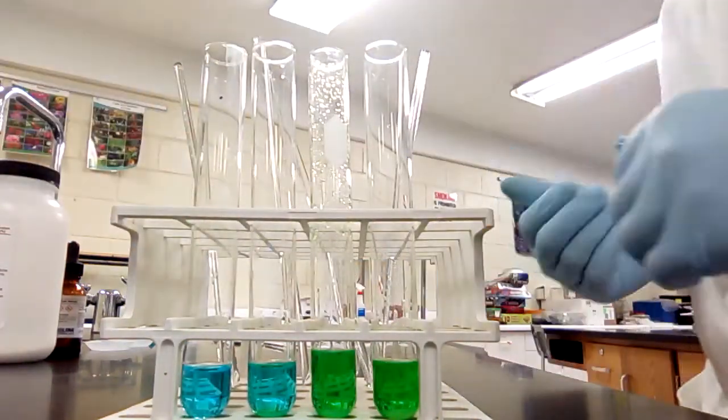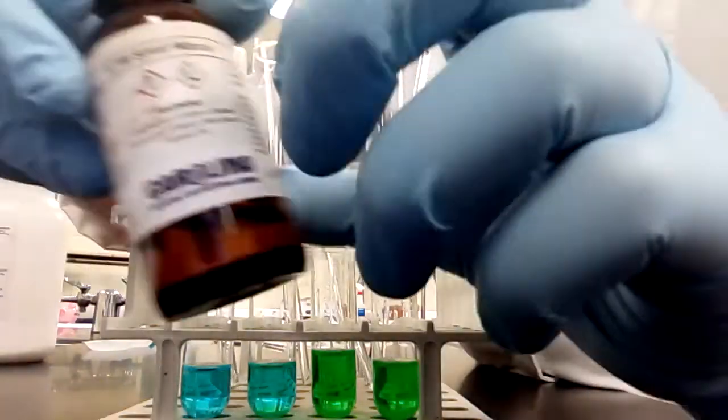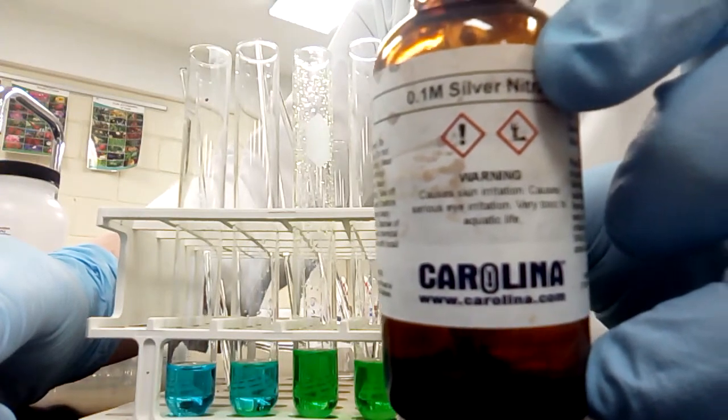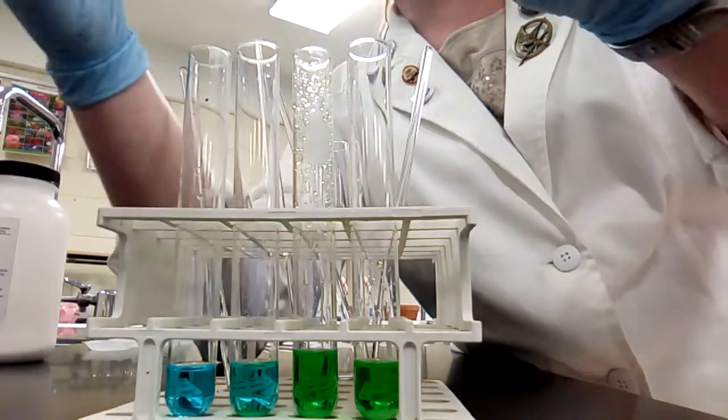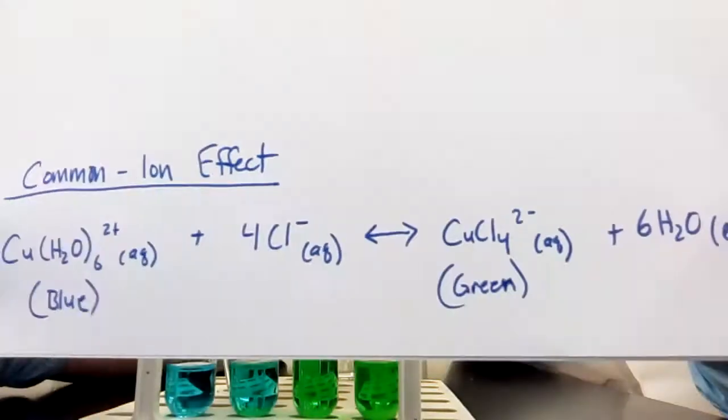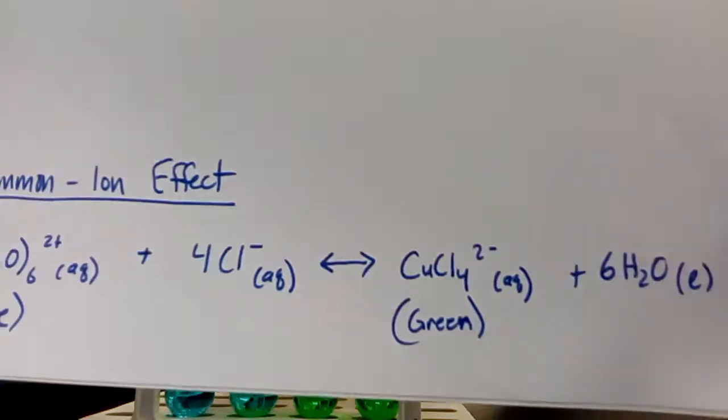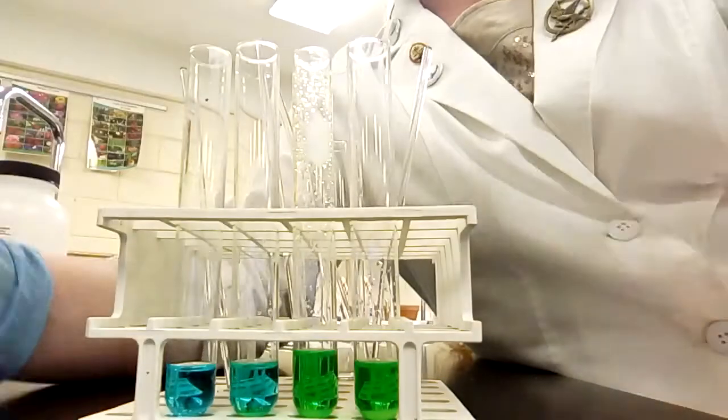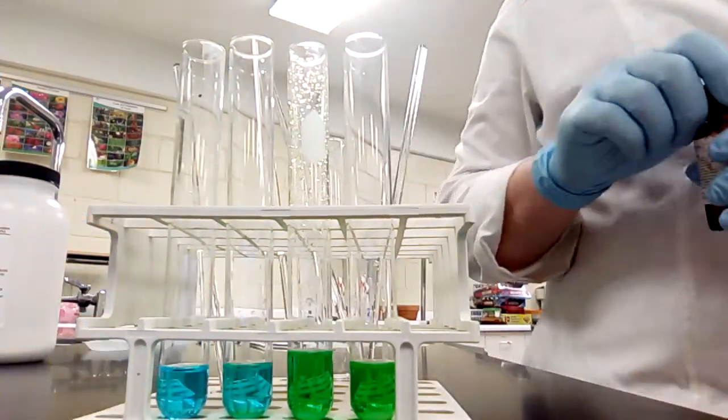All right, so let's add a little something else. This is silver nitrate. Silver nitrate solution. And that's silver, Ag, and nitrate, NO3. If you look at our reaction, that actually isn't part of the reaction. There isn't nitrate written here, and there isn't silver written here. But it might actually do something to the reaction. So let's see what happens when we add a bit of this.